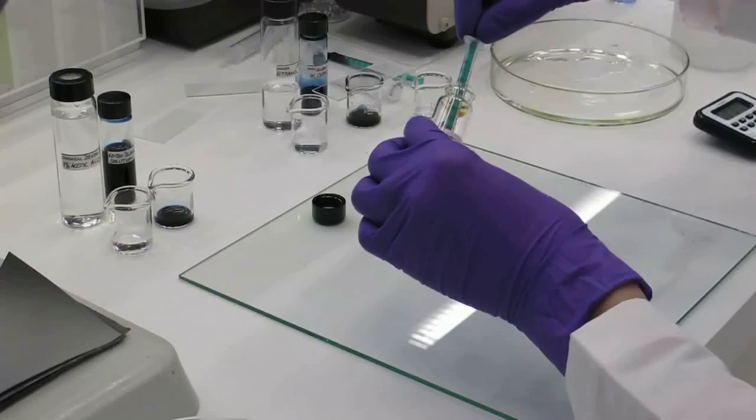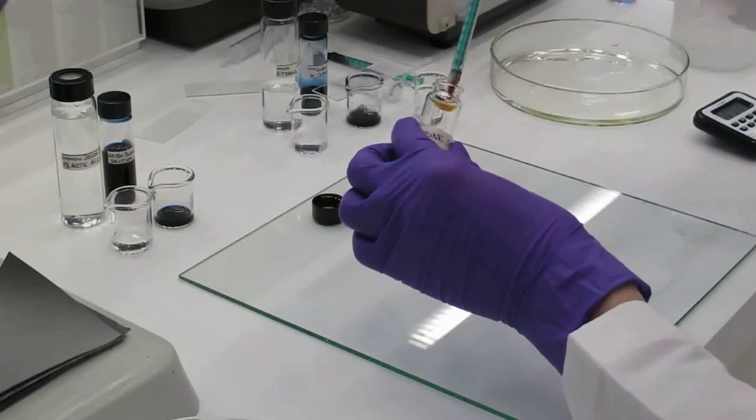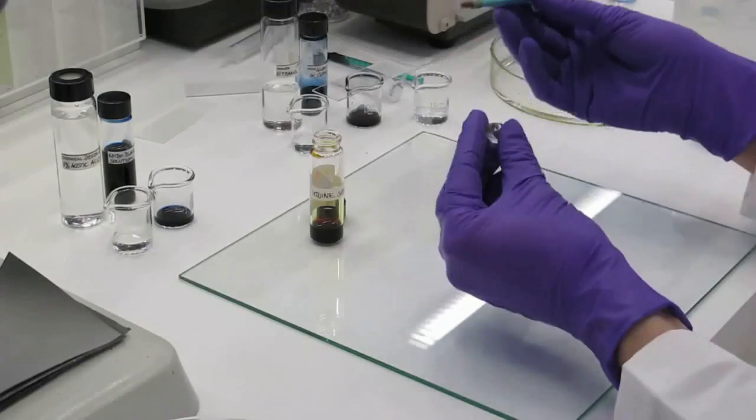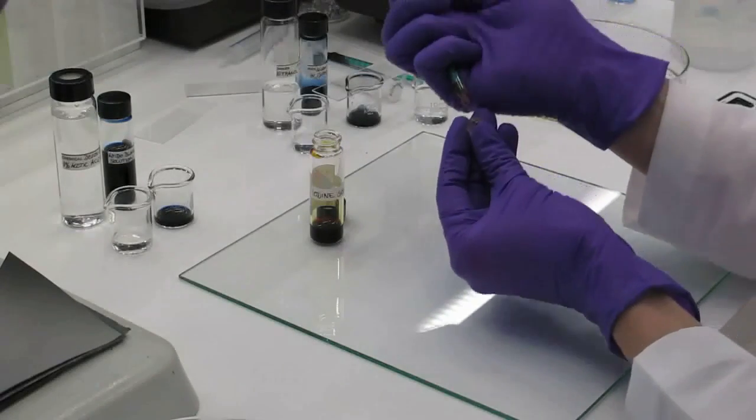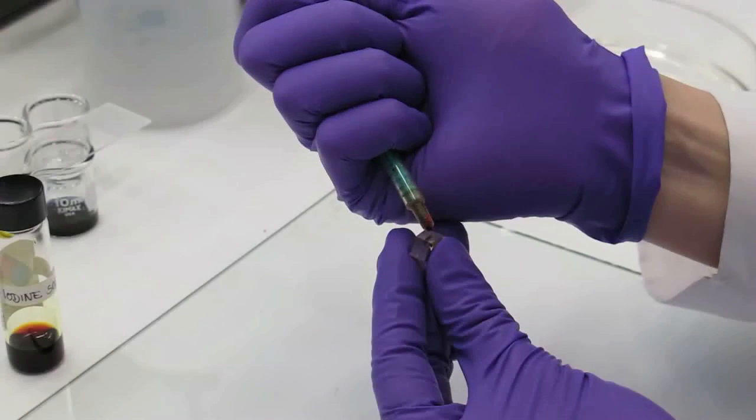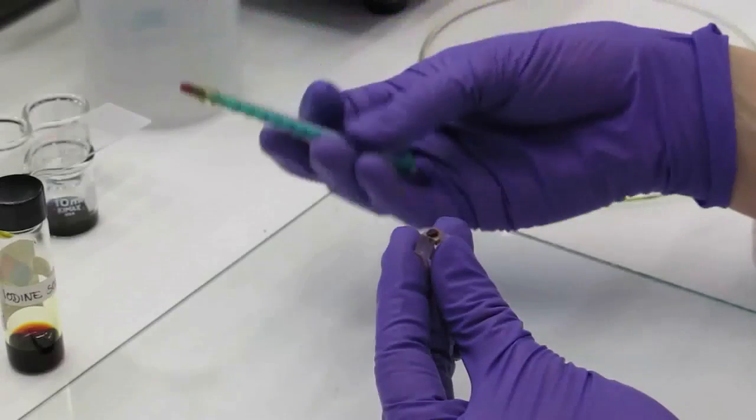Staining for starch is undertaken with iodine-potassium iodide, also known as Lugol's solution. It is a very reliable agent to colour starch within starch-containing material in dark blue-black, and even small amounts of this binder can be easily detected in cross-sections with this method.